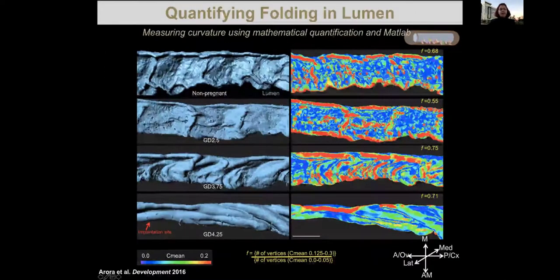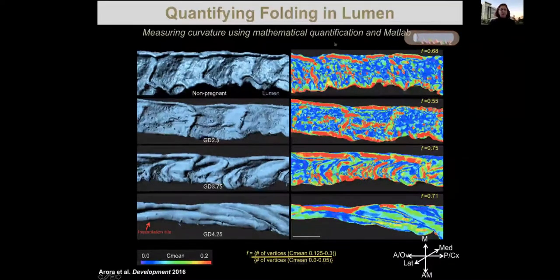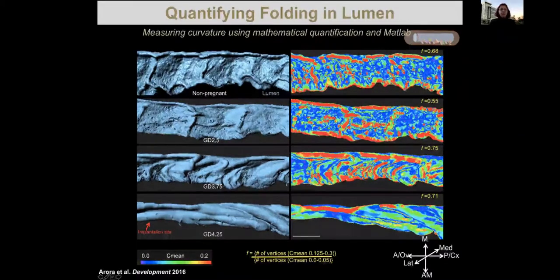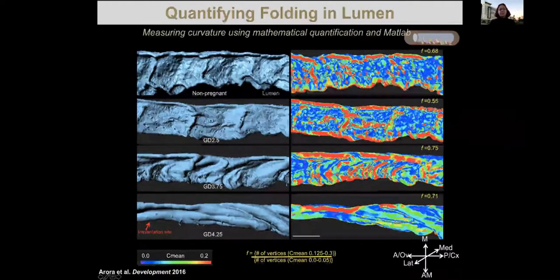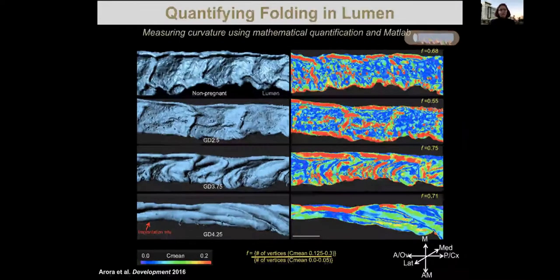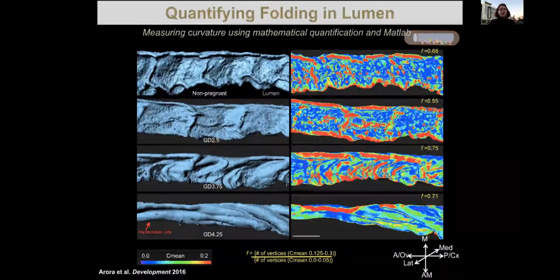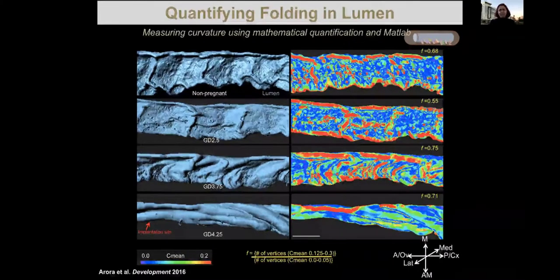We wrote a MATLAB script and integrated it with IMARIS to quantify the folding pattern. Anything in red is very folded and regions in blue and green are relatively flat. So we know that the uterine lumen folds — and the question is, is it useful or relevant? What is the purpose of this folding?